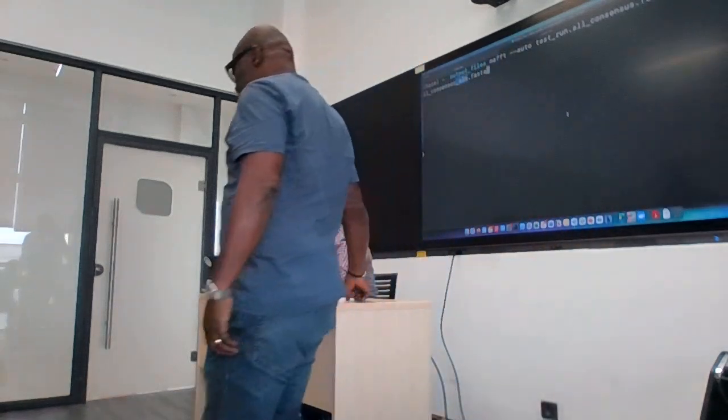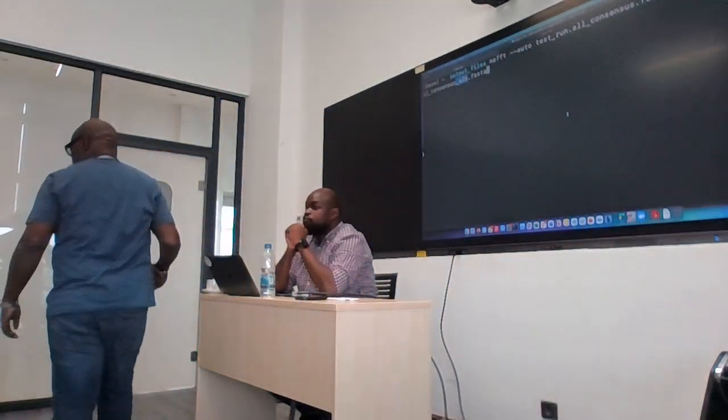Et puis après, vous donnez un nom de sortie. Vous pouvez prendre le même nom et à la place du all mettre quoi? Aligned, pour dire que c'est le fichier aligné. So, again, I'm insisting, in informatics, you have to understand the context. Don't just copy the commands.